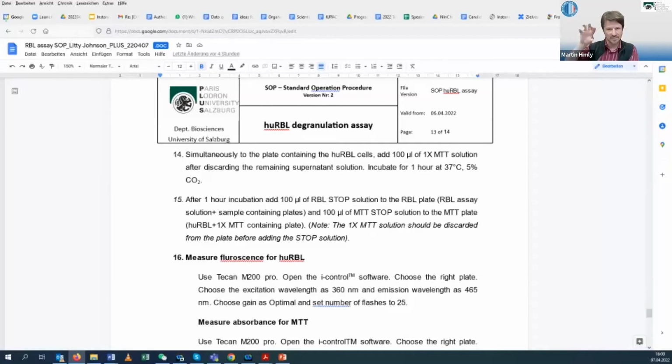So this part, how we have to pre-treat this fetal calf serum or this cell culture medium, would be a module that we could not only include into this protocol here, where we have the link in the SOP or in this instance map earlier, but also put as a general little protocol for other cell types, because it's a more general preparation requirement.